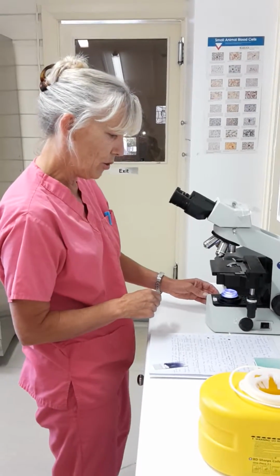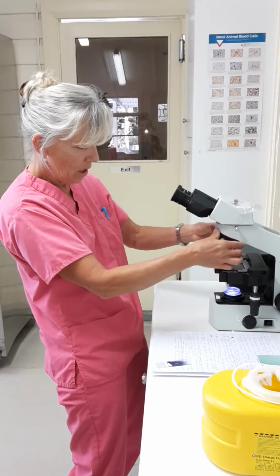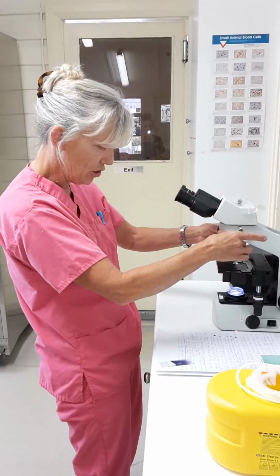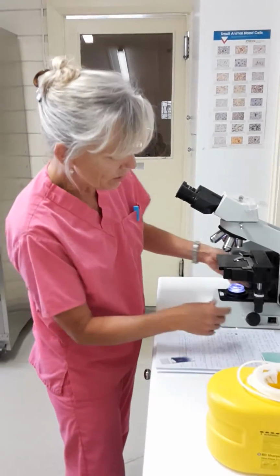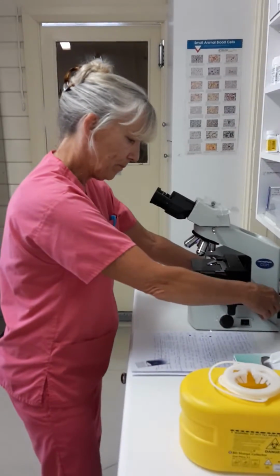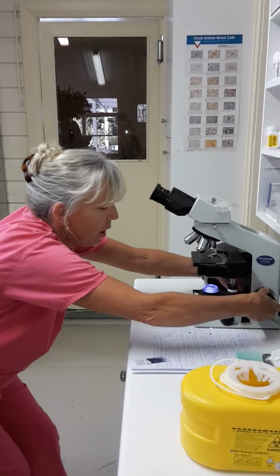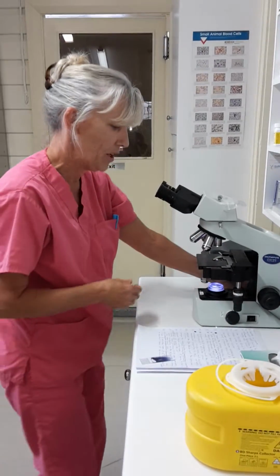Okay, we're going to change the objectives to the lowest magnification using the nose, which is this thing here, around to our red setting, which is the lowest magnification setting. We are then going to use the coarse focus, which is this large one here, to lower the stage down to its lowest position. Okay, so that's up. I'm going to lower it right down. It was already down to its lowest position, but I'll just put it back up and then lower it down.